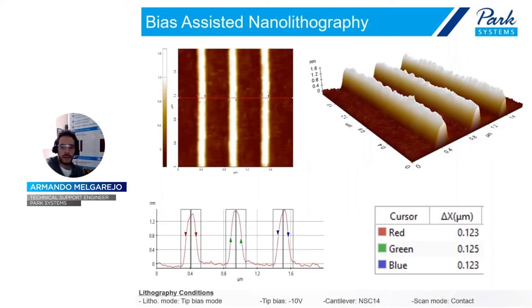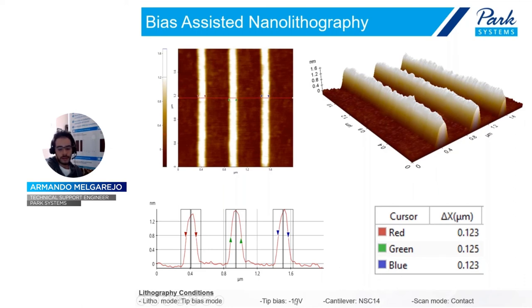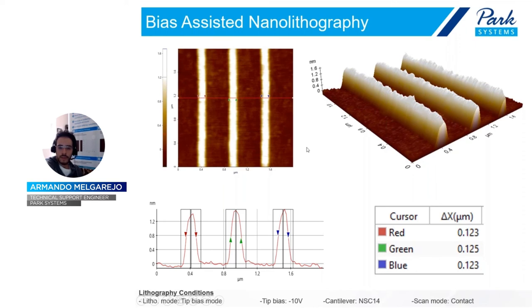Another example demonstrates the replicability of our software. Three lines were written using an NSC-14 gold-coated cantilever with a constant voltage of minus 10 volts, all in contact mode with post-scan also in contact mode. The width of the three lines is essentially the same — approximately 123 to 125 nanometers — and the average height is 1.4 nanometers for all three. This confirms that the software can replicate results accurately and that the lines are completely straight without any deformation or angular deviation, thanks to the closed-loop scanning system.